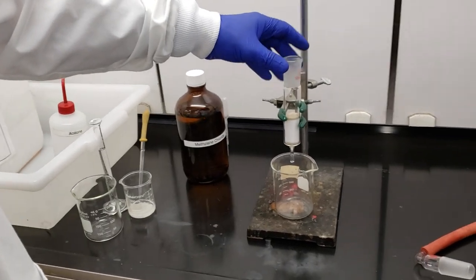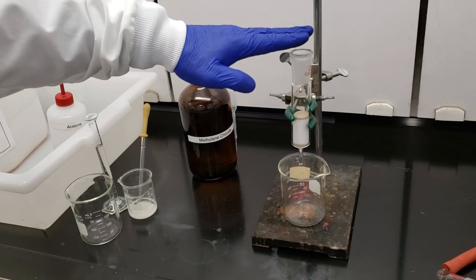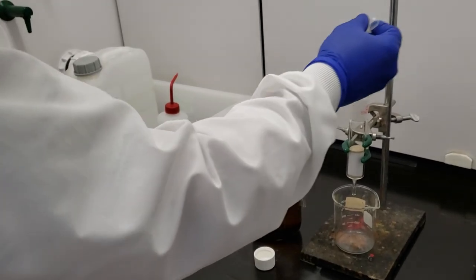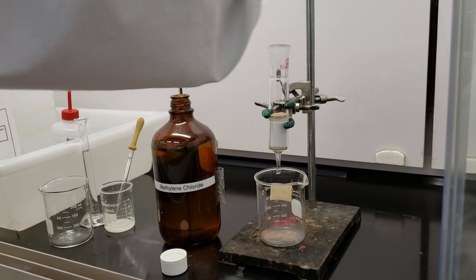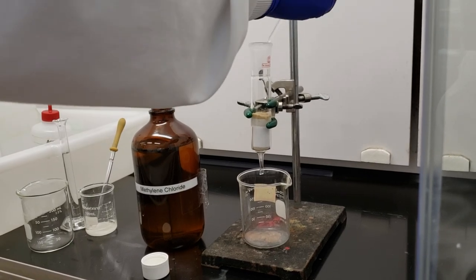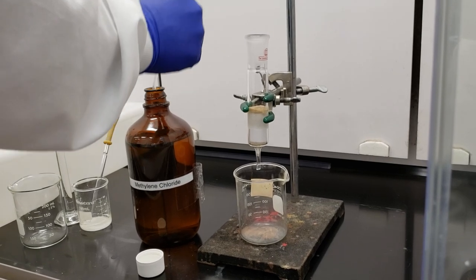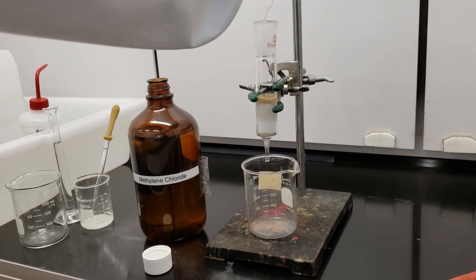So we're ready to set up our column. We have it clamped here to our ring stand inside the hood. Before we can put our product mixture onto the column for separation, we've got to wet the column using methylene chloride. We've got that here, so I'm going to go ahead and add methylene chloride onto our column and let it drain through. This is going to help pack the column down so that there are no spaces in between the silica gel granules. Run down the side of our column so I don't disturb the top layer of the column, our sand layer. And you should be able to see as the liquid starts to slowly make its way down through the silica gel.